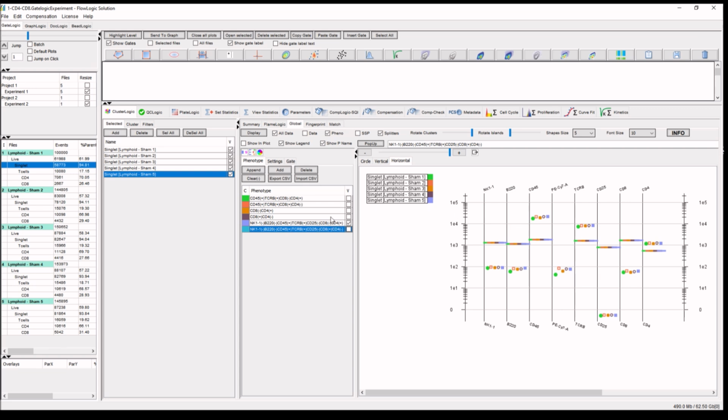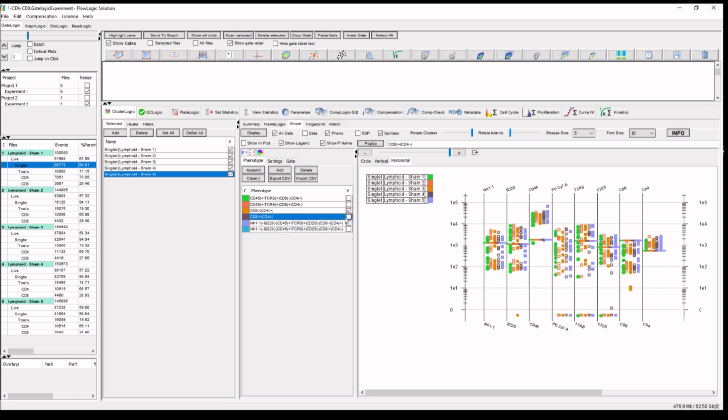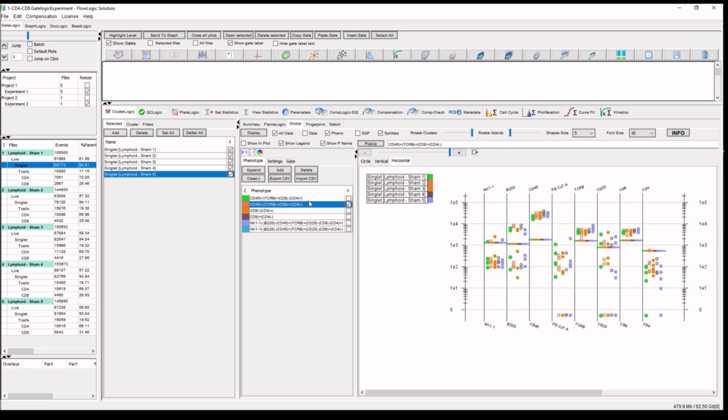And obviously whatever is coming here is coming just via the selection of the phenotype. So you can select your phenotype. This is your filter for your phenotyping search. And here we have all the display, and this is totally new.